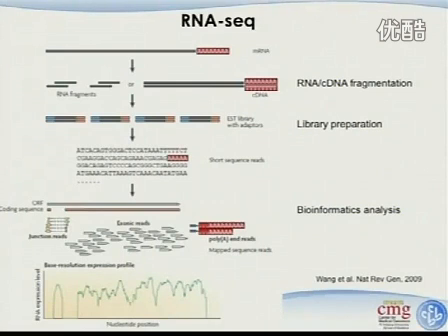All right, and then after that will be the analysis part. It sounds pretty simple, but you know that each individual step, both the biochemistry part and the bioinformatics part, can be pretty annoying. But I'll give you a trick. As a biologist, you get the total RNA and send it to GNAT, and GNAT will send the data to me, and that's the end of it. So it's pretty straightforward if that's the case. All right.